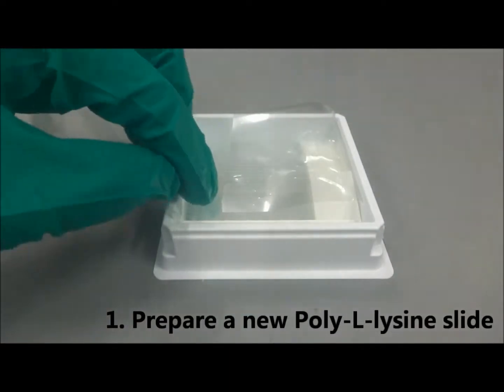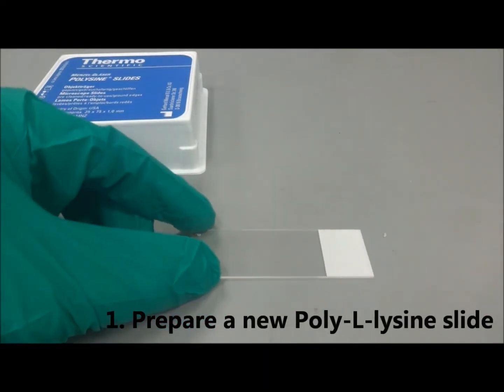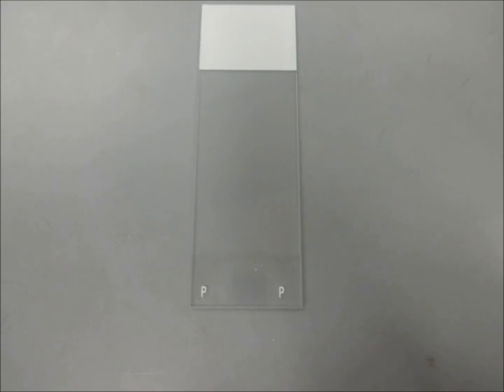First, prepare a new poly-L lysine microscope slide. The side labeled with the letter P should be facing up. This is the side that is coated with poly-L lysine.